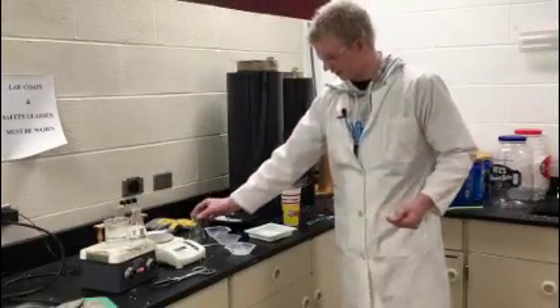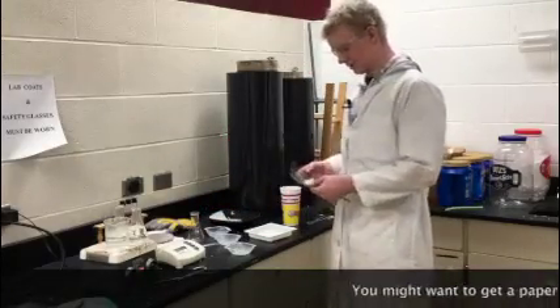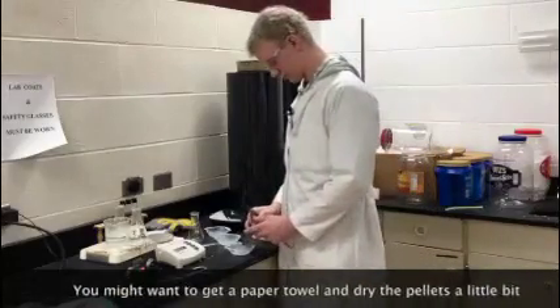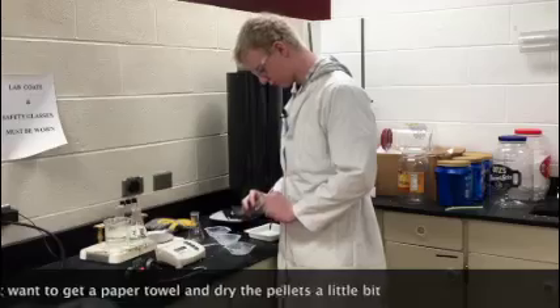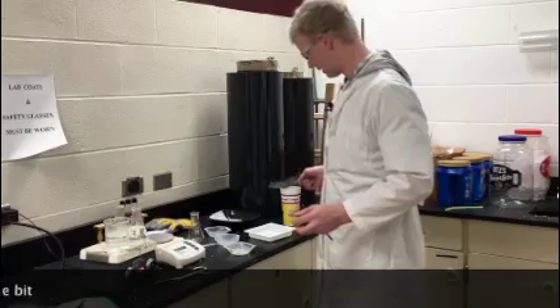Now that I have the flask empty, I am going to put these in the massing tray. That is off.